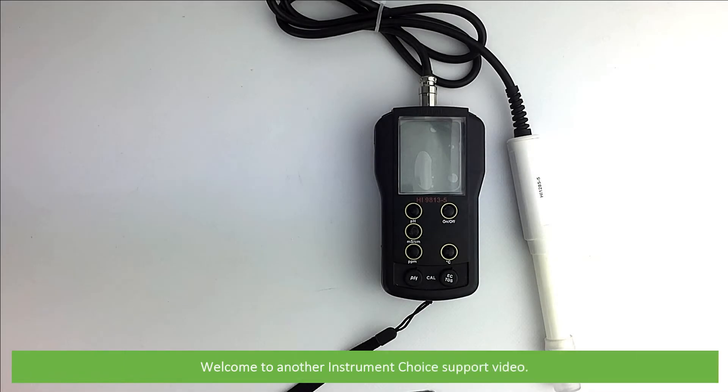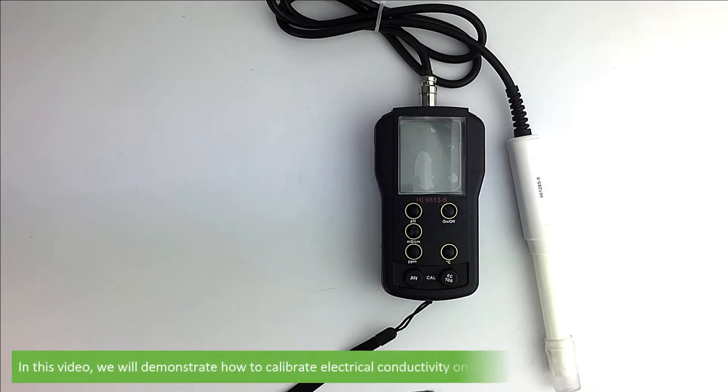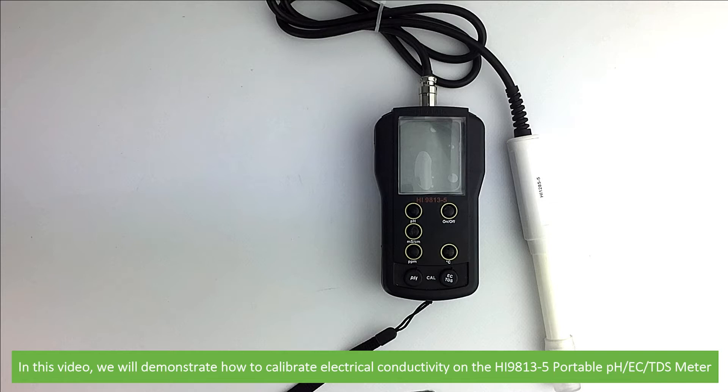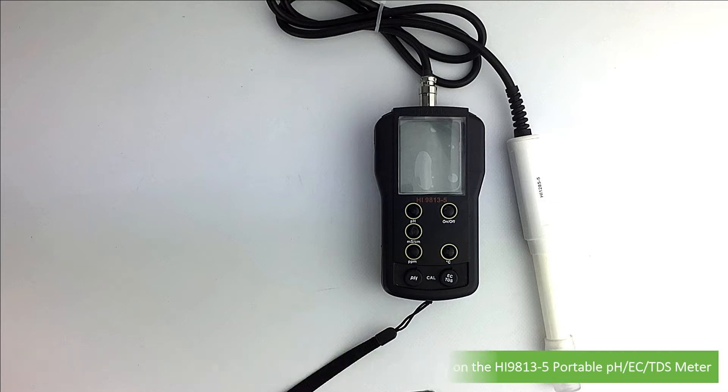Hi and welcome to another Instrument Choice support video. In this video we'll demonstrate how to calibrate electrical conductivity on the HI9813-5 portable pH, EC, and TDS meter.